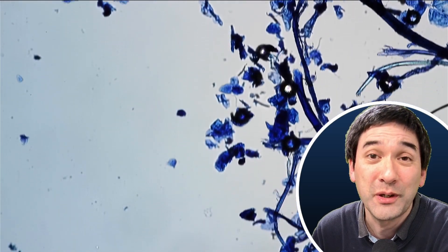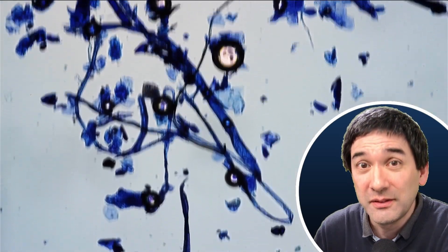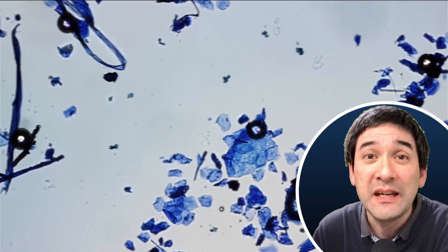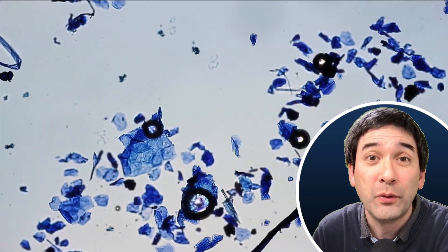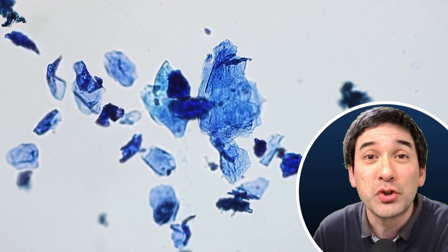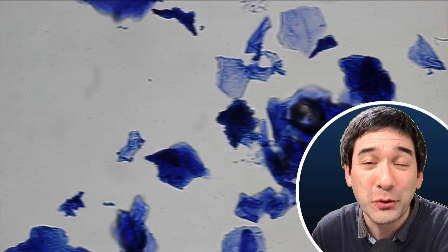And this is essentially what I've done here. I added a little bit of the stain methylene blue, and cells—skin cells and also other cells—they really like to absorb the blue stain and therefore turn a dark blue like you see over here. And this makes them much more visible. But also, this is a sign that these are indeed cells that we've got here.